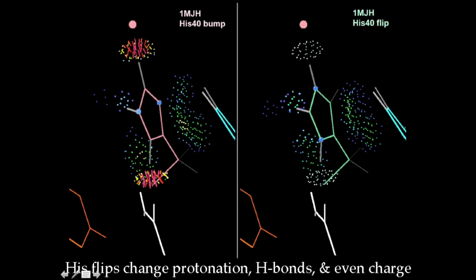And these can be done automatically even without looking at the map at moderate resolutions. They're still worth doing at lower resolution, but they're not going to be nearly as effective because the contacts may not be in quite the right place.